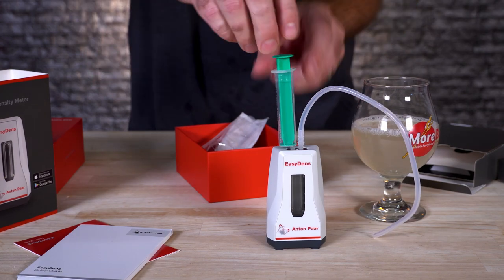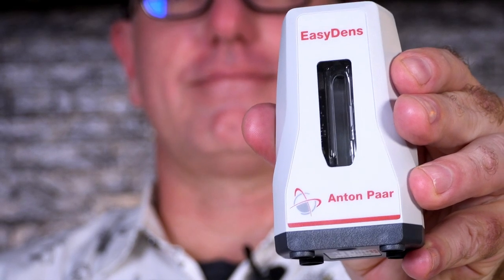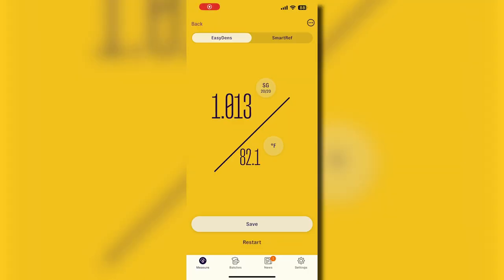So let's start with how it works. It's just like a hydrometer — it's measuring the density of the solution, but it's doing it via sound oscillation. So it's highly accurate and also less susceptible to temperature variance. This is the same method that Antompar uses in their high end brewery equipment, but now it's in a nice small package at a better price for the home brewer. They've been able to lower the price by eliminating the need for a screen, so it pairs with your smartphone device via Bluetooth.